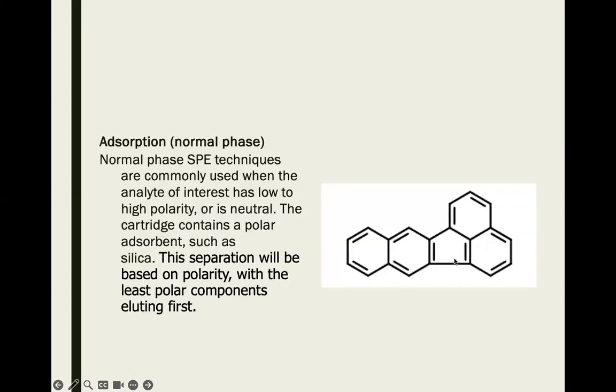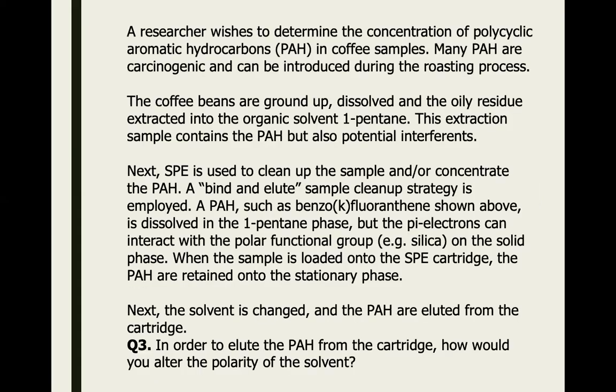They are aromatic. So there's a lot of pi electrons here. So how is this PAH compound trapped inside the adsorbent? It is by the interaction of the pi electrons with the polar functional group of silica.